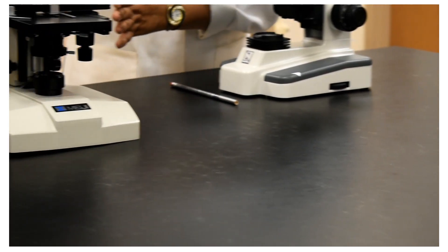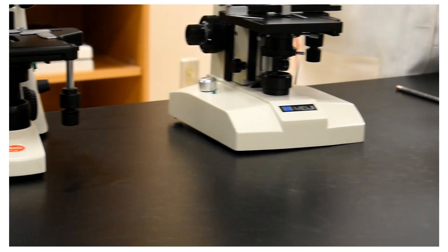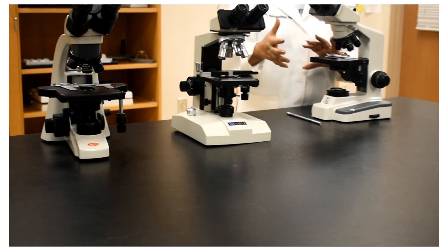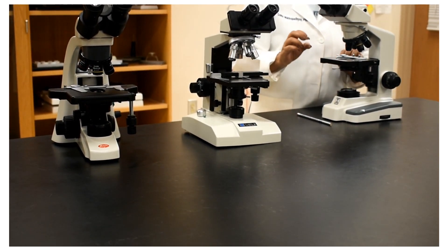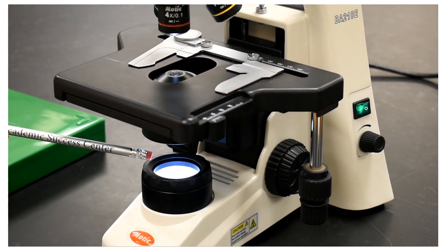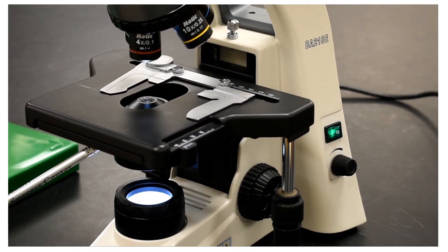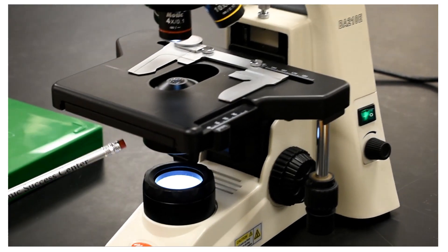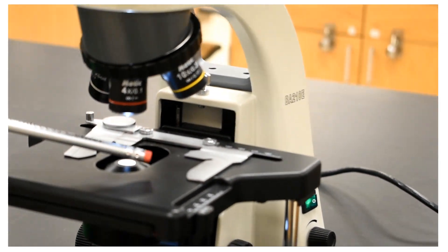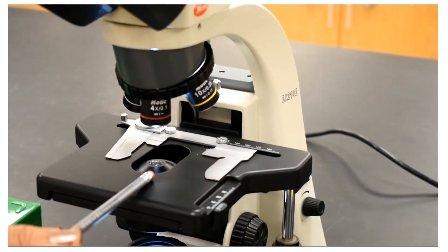Those are some differences you will encounter when you first start with the microscope. Now I will use one microscope to go through the rest of the structures, their names, and their functions. The light is on. Starting from the base and the light source, following upwards, this part is called the condenser, through which the light comes up through the stage. This black square is called the stage of the microscope — we put the slide on the stage.